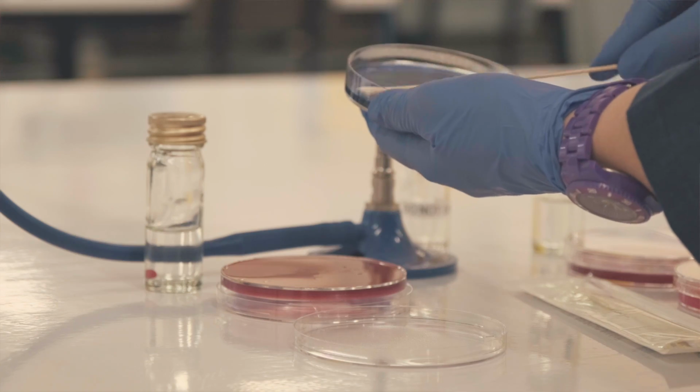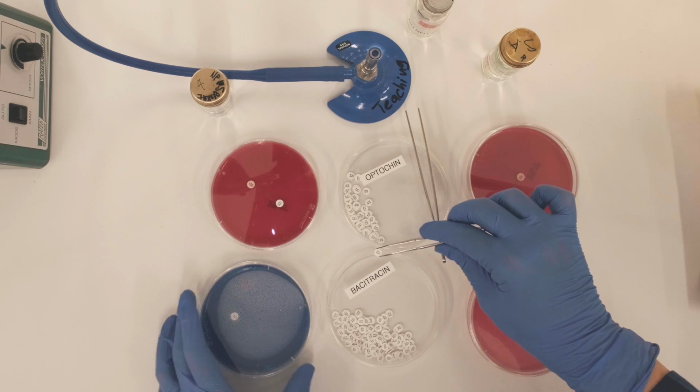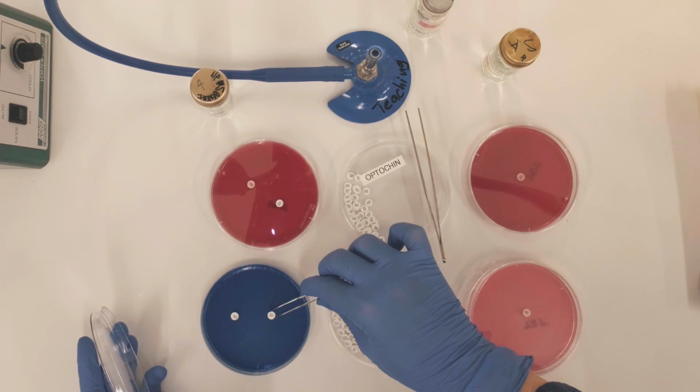Streptococci are gram-positive cocci, characteristically arranged in pairs or chains. Their ability to hemolyze red blood cells to various degrees, growth on selective and differential Mitis Salivarius media, as well as susceptibility to bacitracin and optochin antibiotics are all important criteria for their classification.